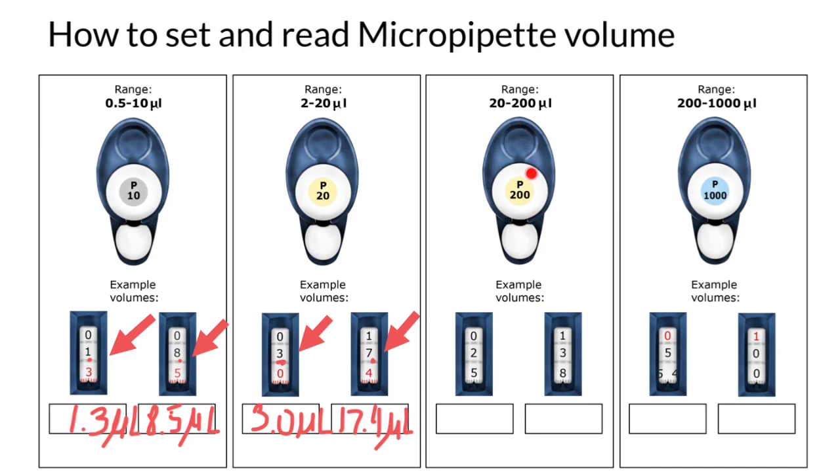Next one is easier. The volume is up to 200. The range is between 20 and 200 microliters. And we read this number just as it is, 25 microliters. And the next one is 138 microliters.